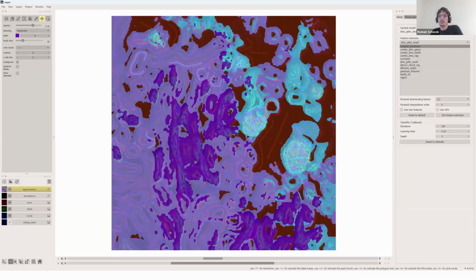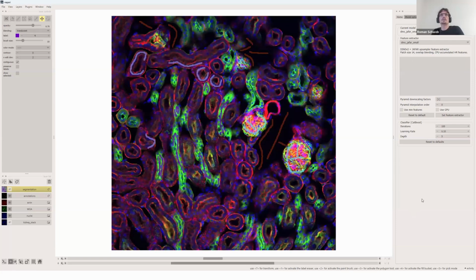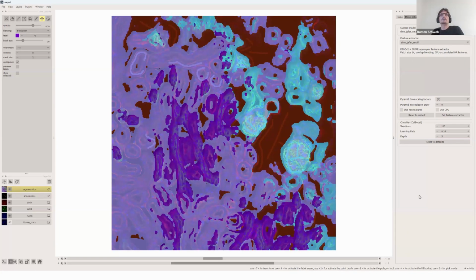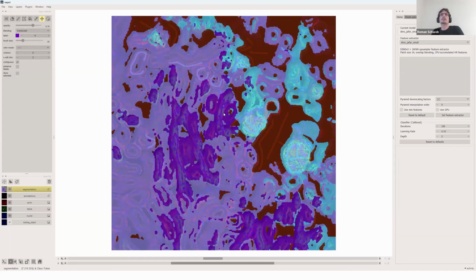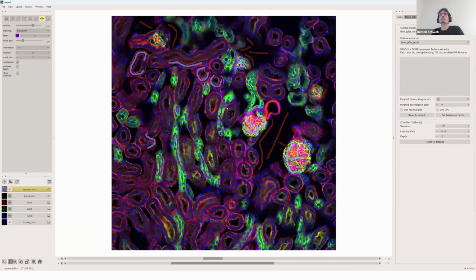So Daniel posted that he would argue that Jafar should perform better also in this case since it's more context dependent. I would actually agree. I think there's definitely a case for this, and probably if we did some more annotation, you could probably get the best results maybe really with Jafar.